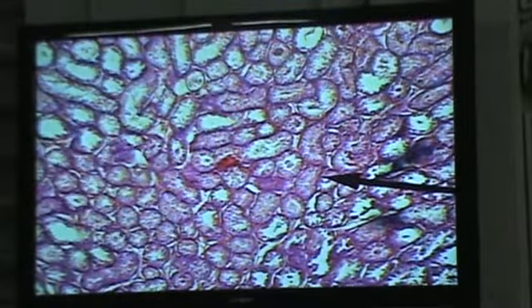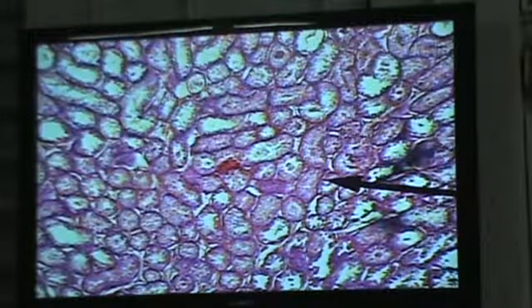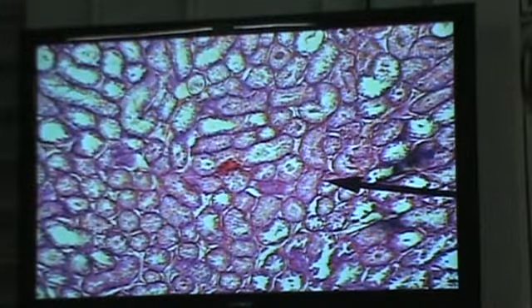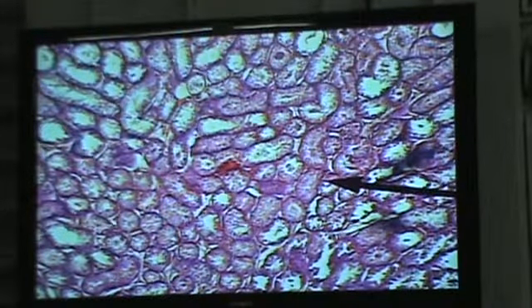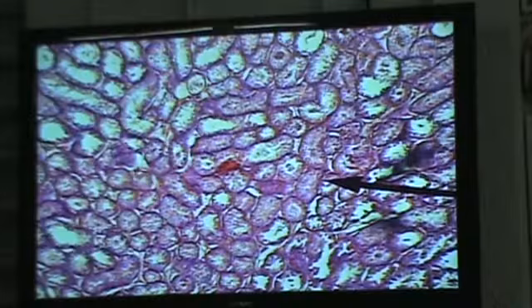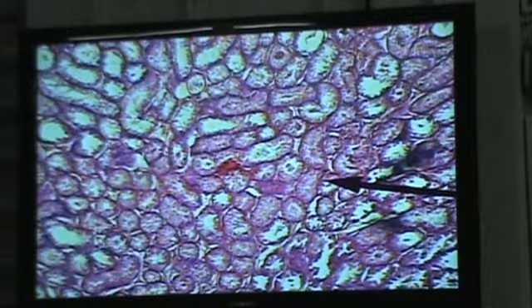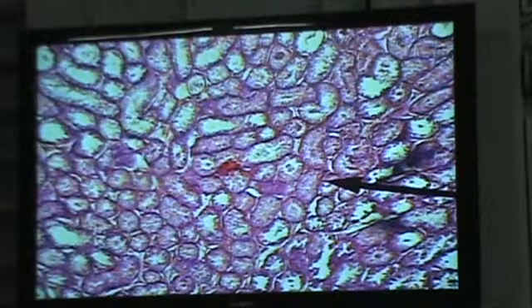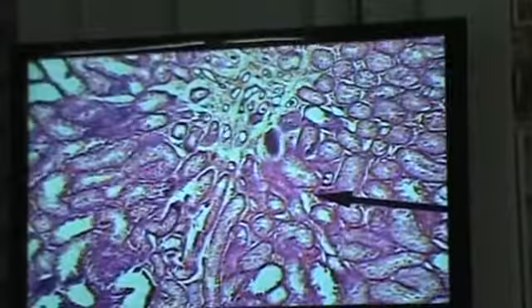Very good. Pass that right here. You see a little diagram that I'm passing around. We just pass it around a little bit. Here you can see the seminiferous tubules leading right into the straight tubules, known as the tubuli recti. And these tubuli recti are lined primarily by cuboidal cells. So if you see profiles, you can use this.